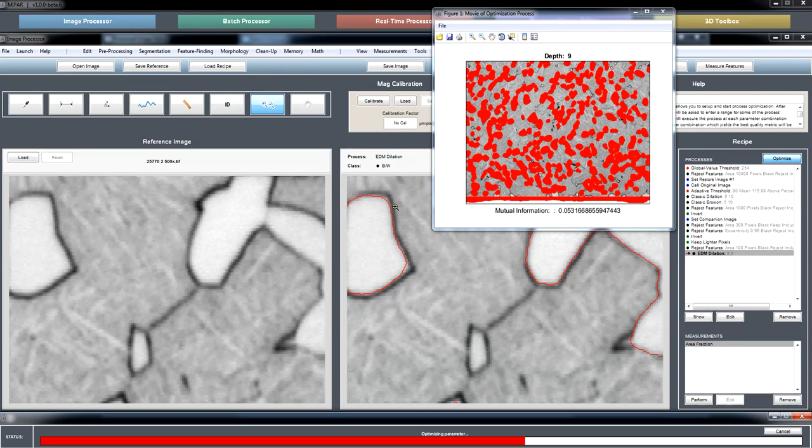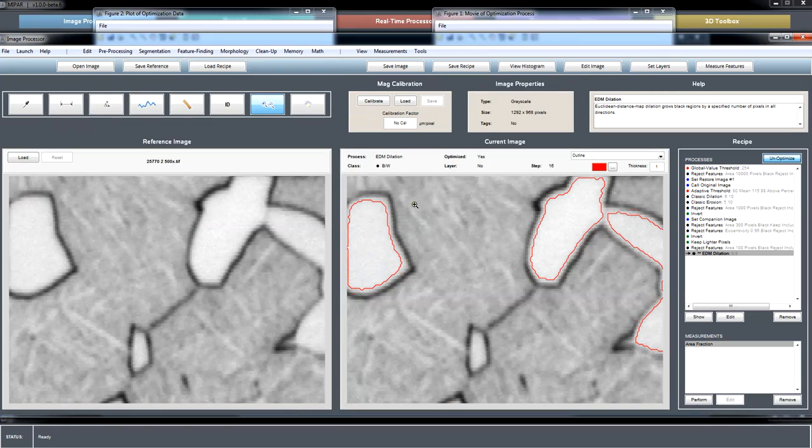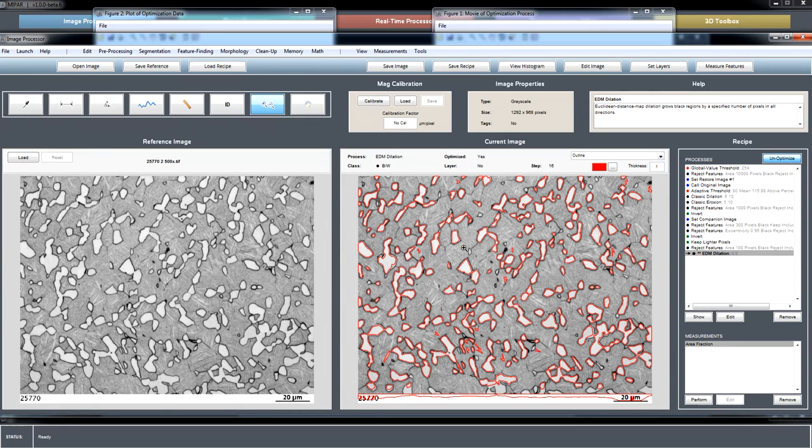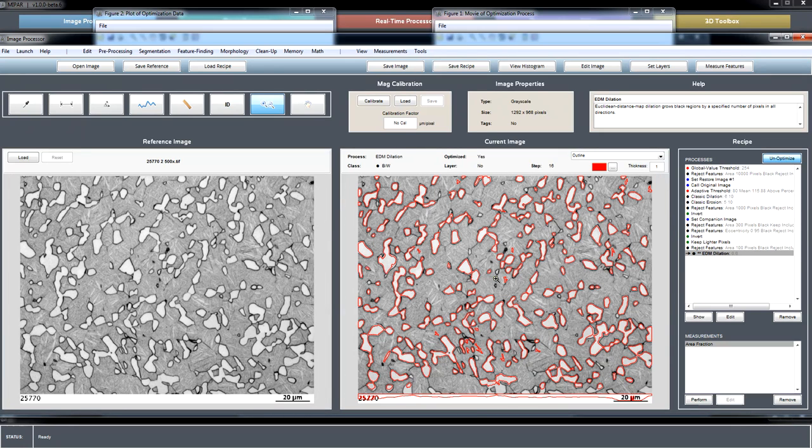And this is kind of like a way to snap your segmentation at the very end. Now that's somewhat surprising. I wouldn't necessarily have thought that, but because you have this gradient around the edge, that's what it's wanting to be your segmentation.